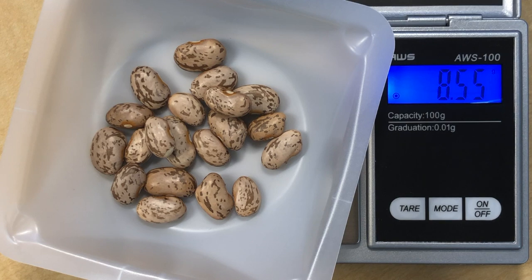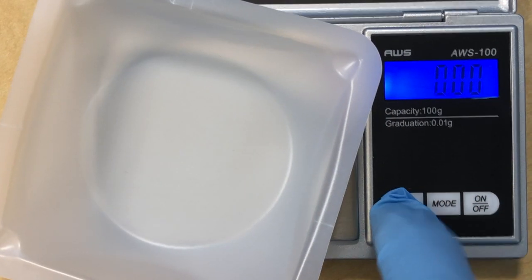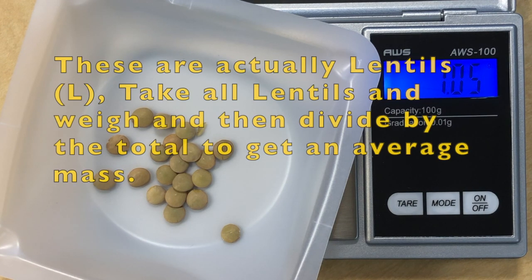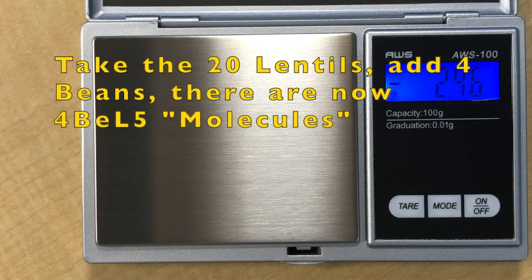Next, take the remaining 20 soy beans and weigh them. Make sure you tare the scale first. The 20 soy beans weigh about 1.05 grams. Dividing 1.05 by 20 gives 0.0525 grams per soy bean.